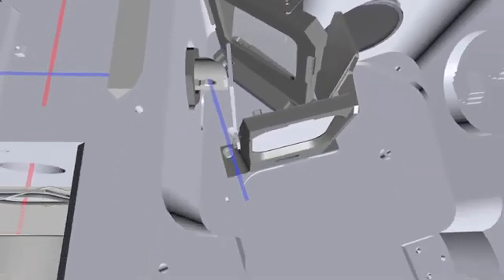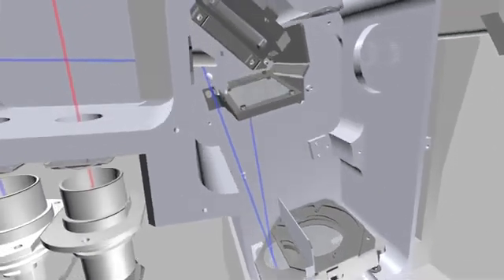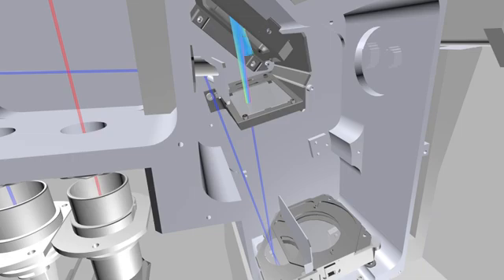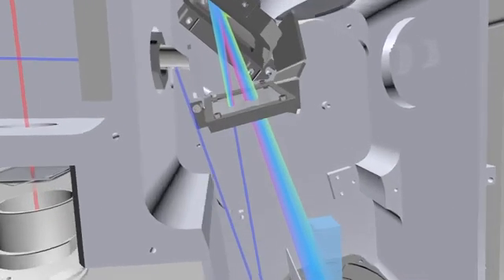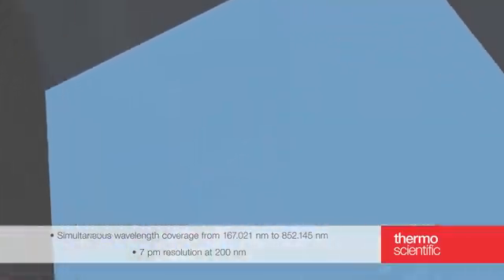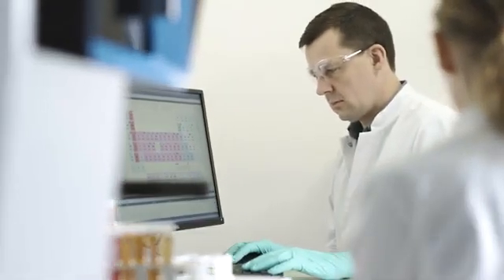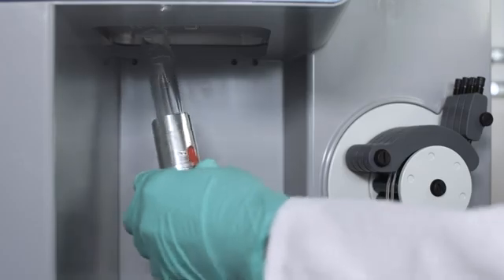Ultimate workflow efficiency. The unique combination of a CID detector and dual pass optics delivers uncompromised sensitivity at high speed. The intelligent full-range analysis mode captures the entire spectrum in one exposure. The iCAP Pro ICP-OES series features a vertical plasma interface achieving a new level of robustness.